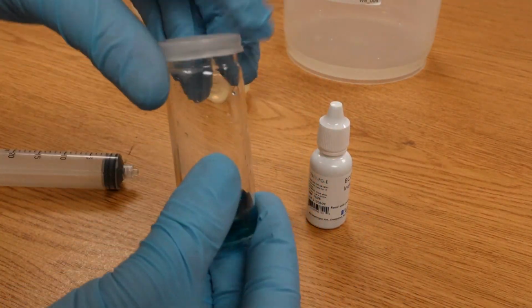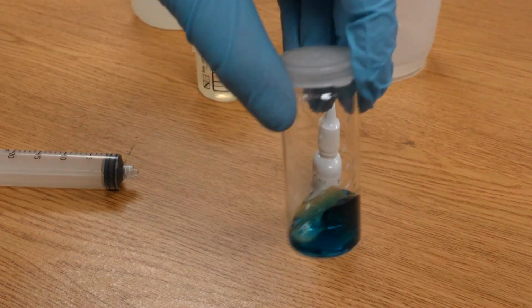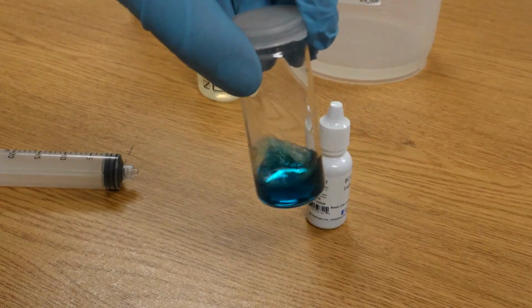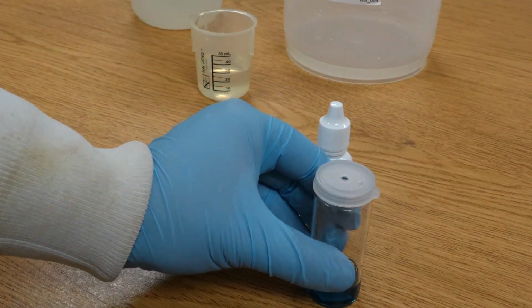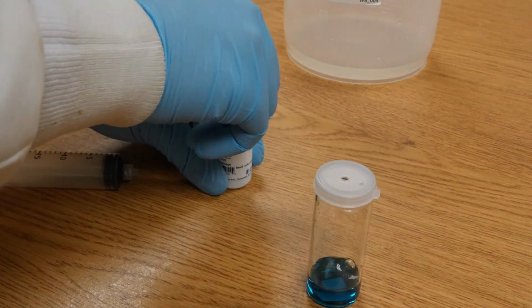Once the indicator is added, cap the vial and gently swirl to mix. Be careful when swirling, since the lid of this vial has a hole at the top. The solution will turn blue-green. If you are using the tablet, ensure that the tablet has been fully dissolved before proceeding.